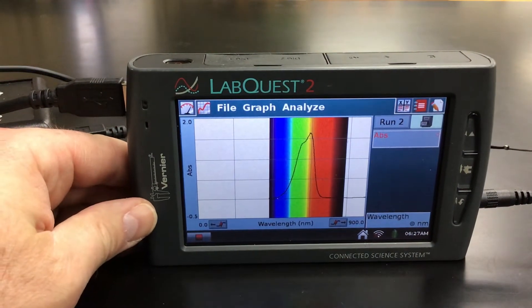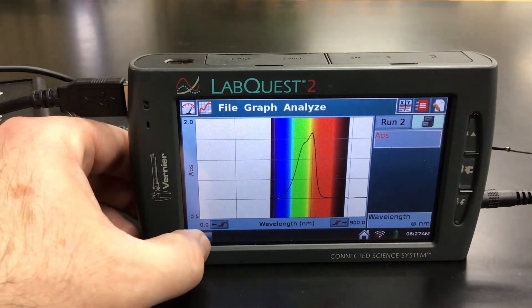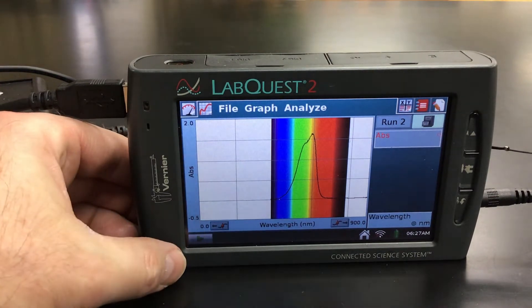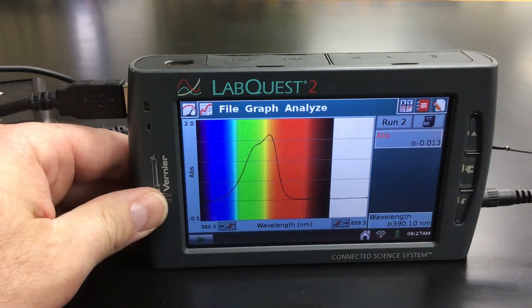We're going to see our nice graph there. We're going to go ahead and hit stop once we have our nice peak. There we go. And then we're going to set our wavelength at 590.